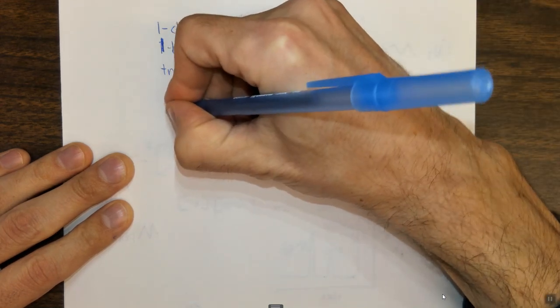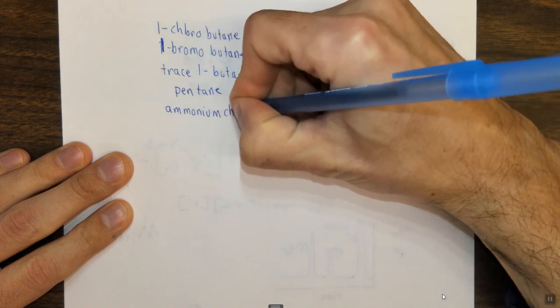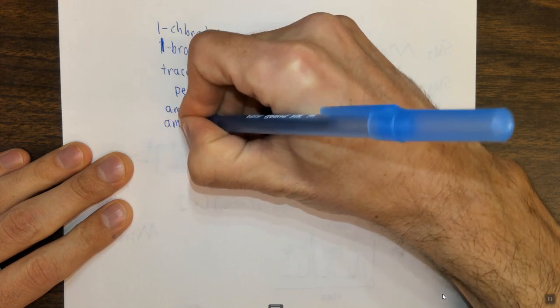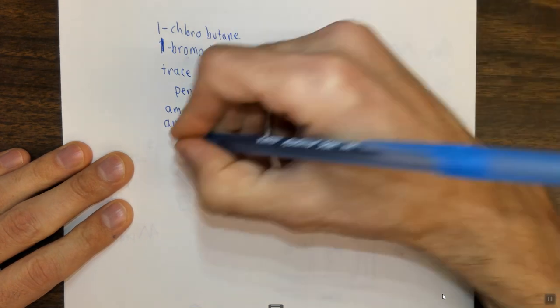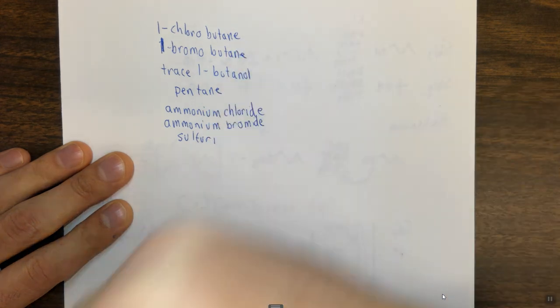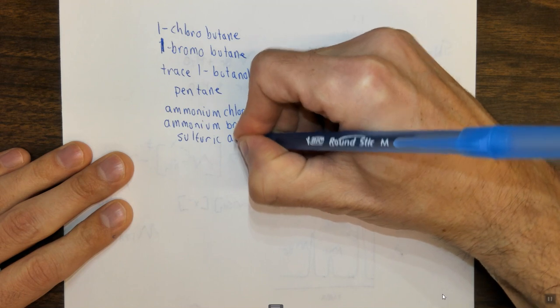We're going to have leftover ammonium chloride and ammonium bromide, because these are not the limiting reagents, so they're definitely going to be there. We're going to have sulfuric acid, because it doesn't get used up in the reaction completely.